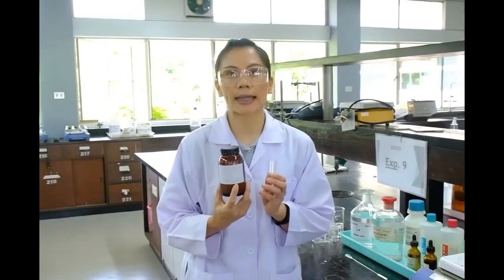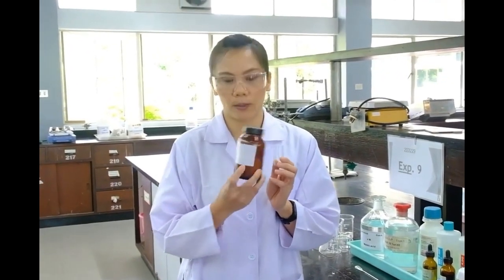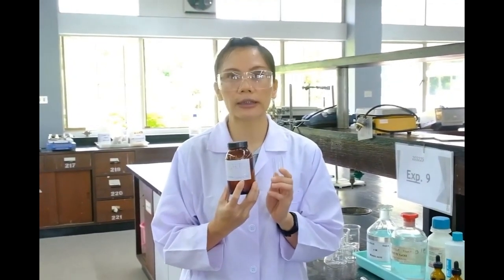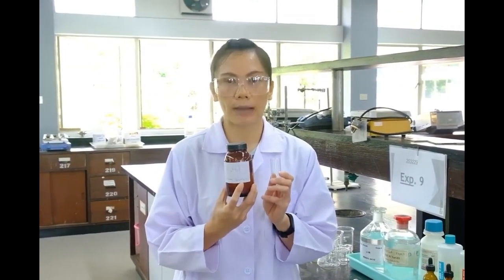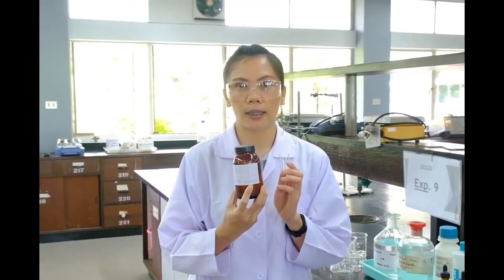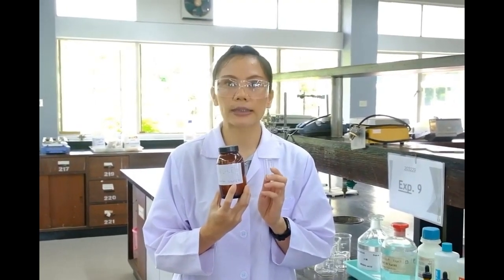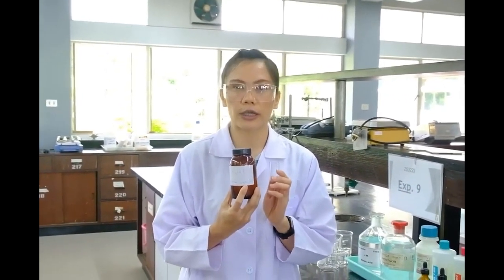For the first part, standardizing the sodium hydroxide solution, you will weigh KHP, potassium hydrogen phthalate. The first method is to weigh 1.02 grams of KHP using a 4 decimal place balance, weighing it only once. Next, dilute the substance with distilled water in a 100 ml volumetric flask. Then, pipette 25 milliliters of the solution 3 times into an Erlenmeyer flask and titrate with sodium hydroxide.